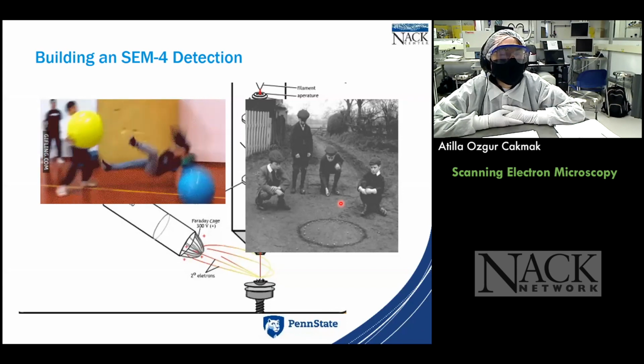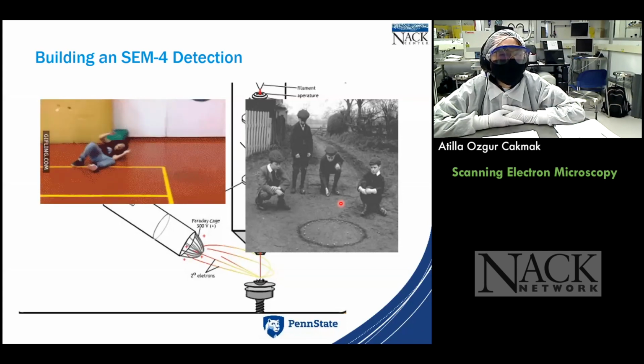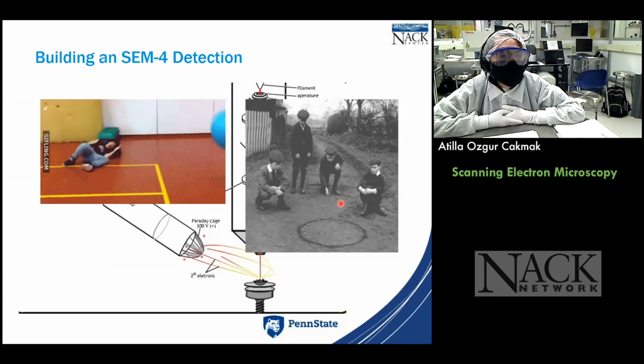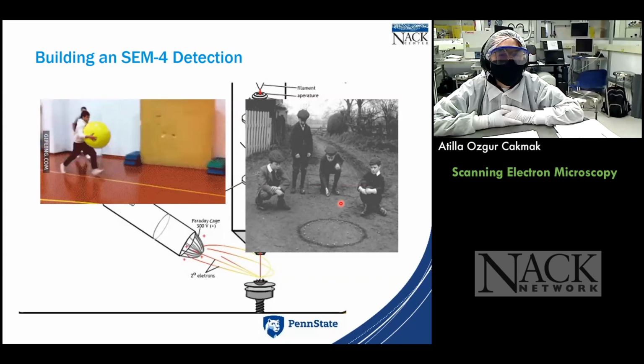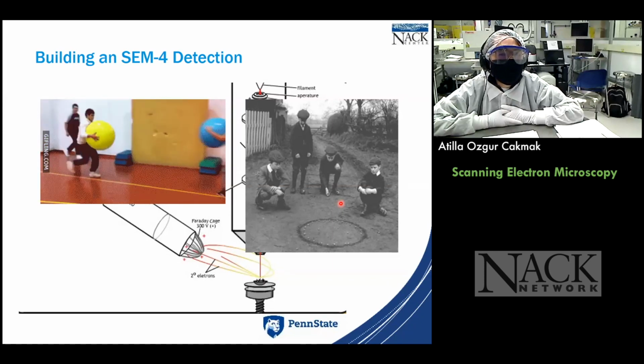So the atom is, of course, much stronger. It will be there. It won't be immediately losing its position, or make a huge amount of change. It's in momentum, putting it in physical terms. So what we will get is the blue electron coming back from the sample. We have to detect the blue electron after this interaction.